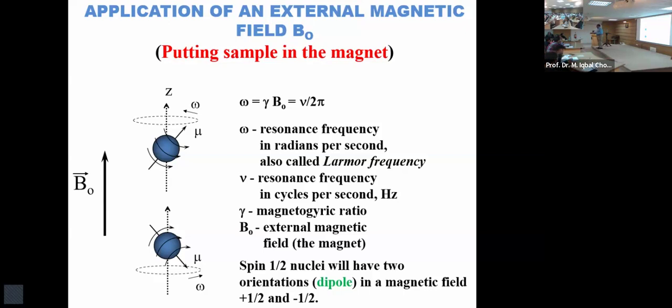The magnet is the same, but the response of different elements to the magnetic field is different. Exactly, if you bring pairs of different metals to a permanent magnet, they would have a different response to it. In exactly the same way, different elements would have a different response to a magnetic field.